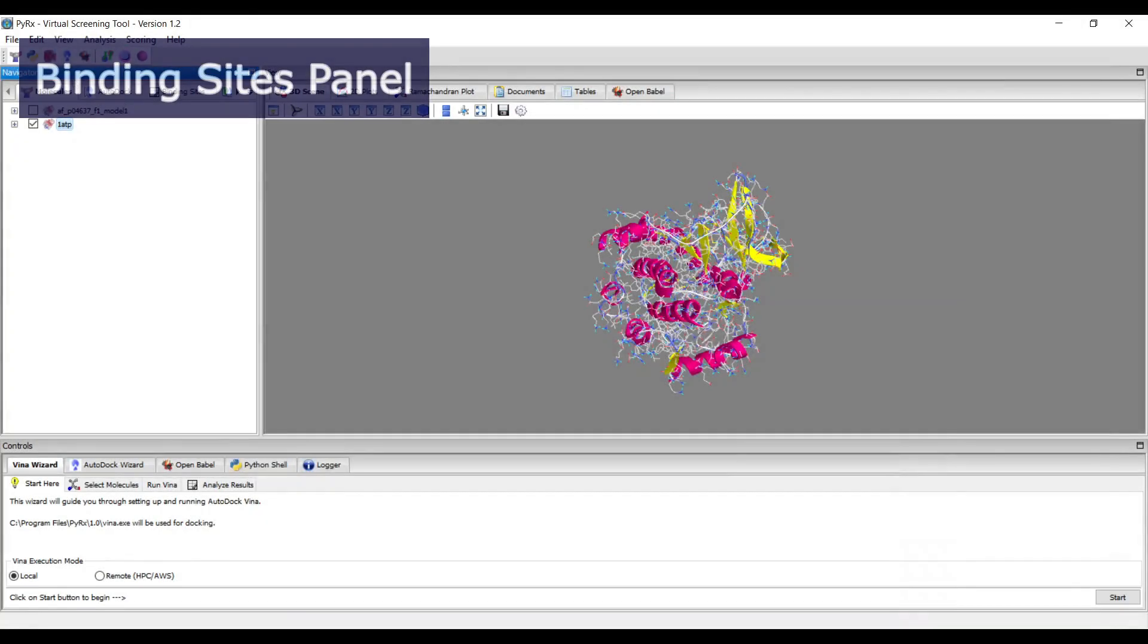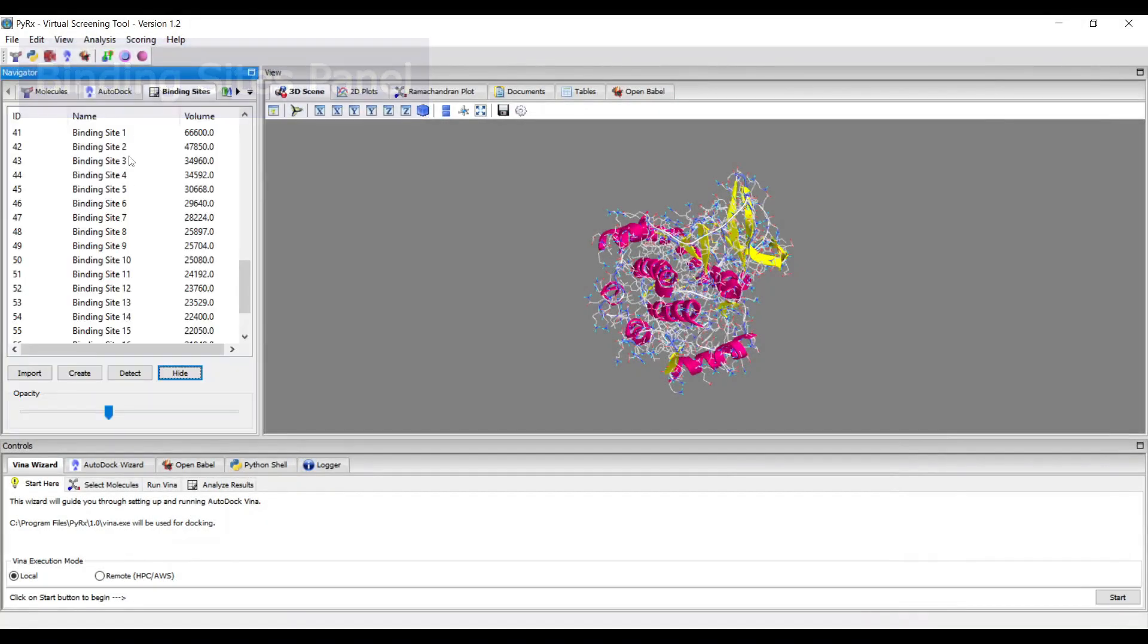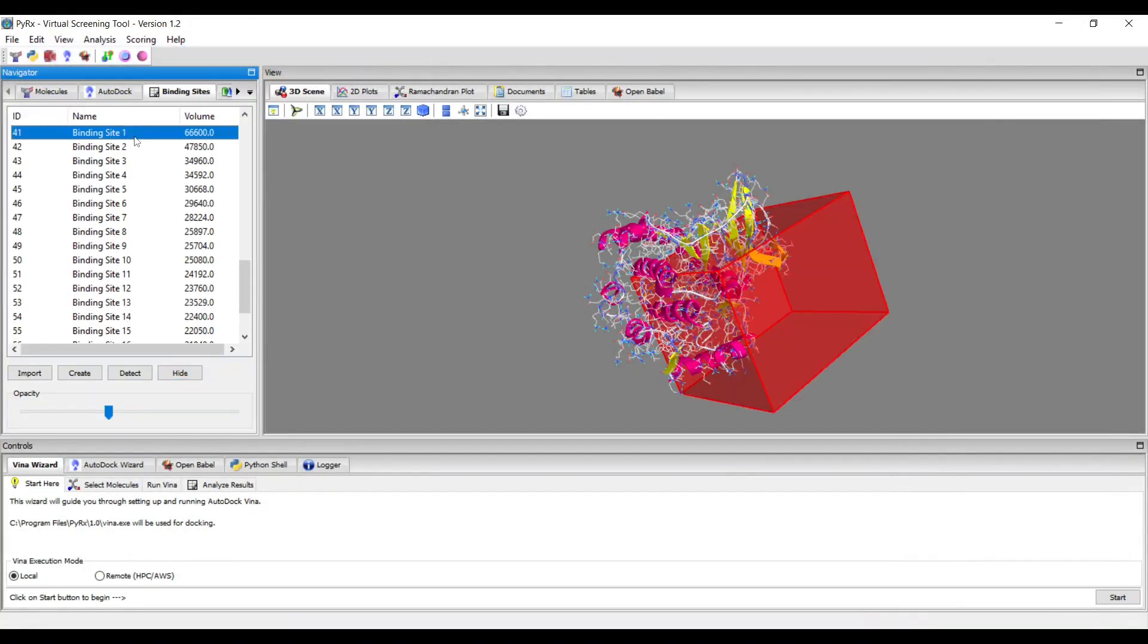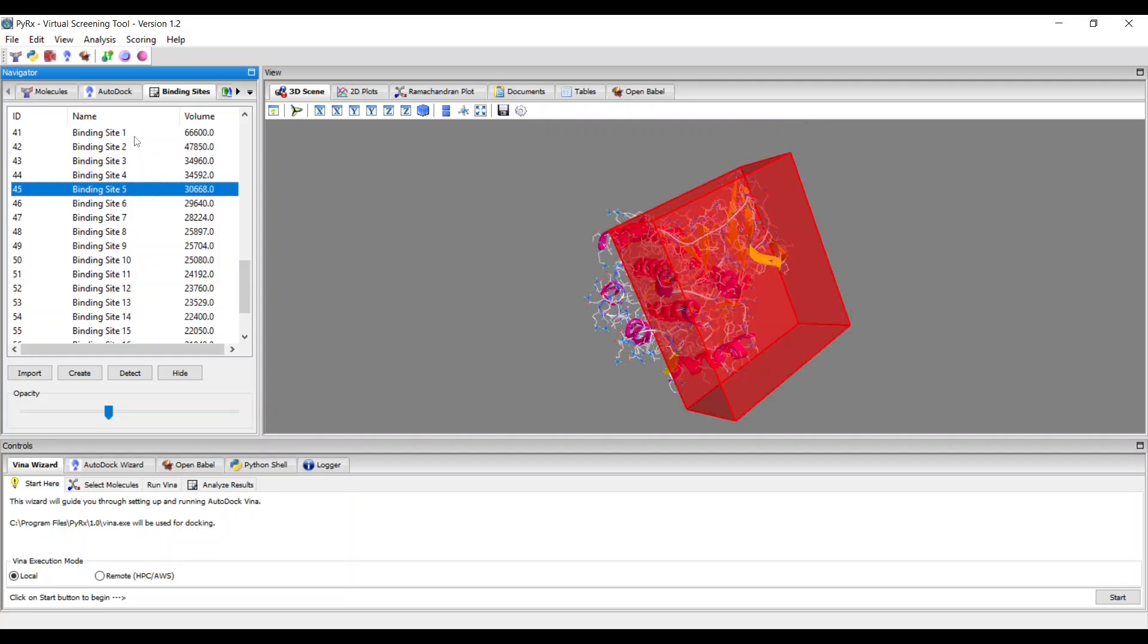You can now manage binding sites using the Binding Sites panel, which allows you to store and visualize binding sites.